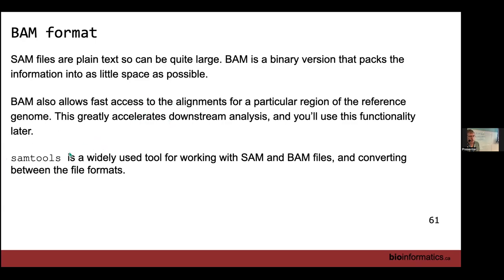And there's a very popular tool called SAMtools, and we'll go through some examples of working with that in the exercises, to search for information in those BAM files and pull it out very, very quickly.